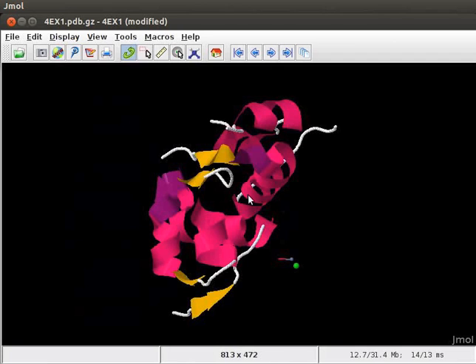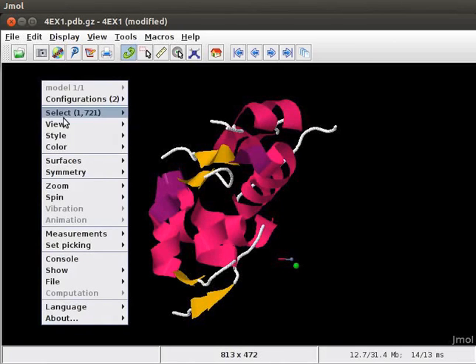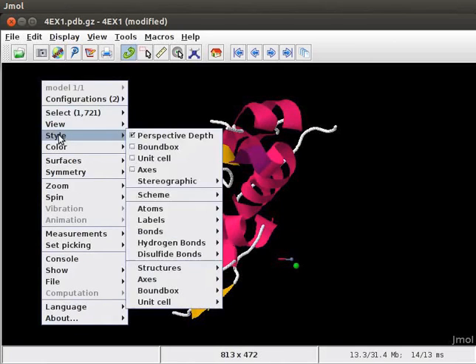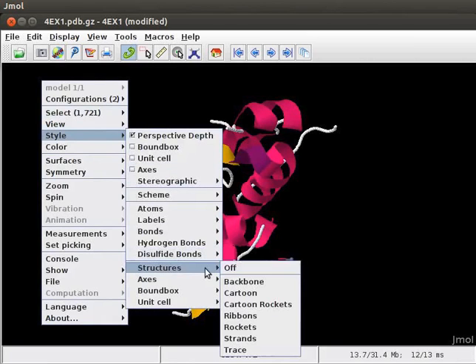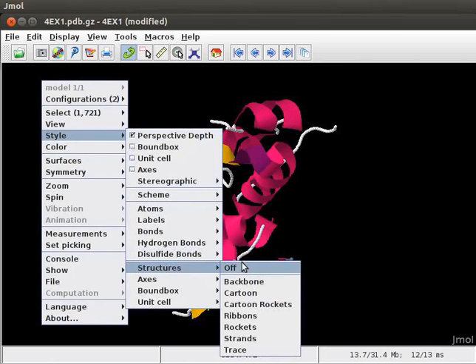For more display options, open the pop-up menu and scroll down to Style, then to Structures. Here, we see many more options to display secondary structure of protein.